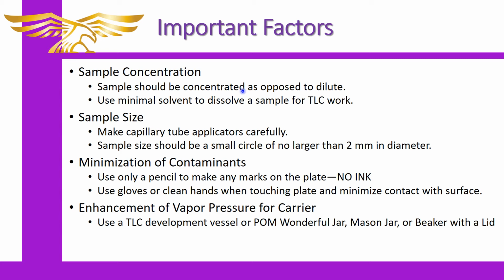It's important not to overuse material in some cases, because sometimes you're trying to do this for a $1 million compound or some kind of expensive product that you've been making, and you want to recover it later. But you also don't want to waste much of it doing something like this, where you could chance the fact that it might not come back out again. So to err on the side of caution, you usually use a small amount, but you keep in mind that you want the minimal amount of solvent possible to keep it concentrated.